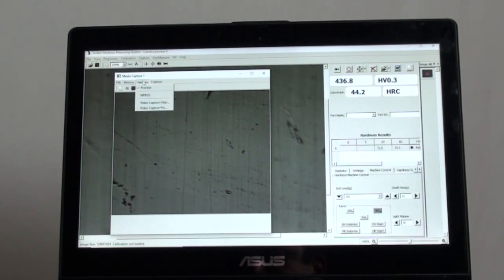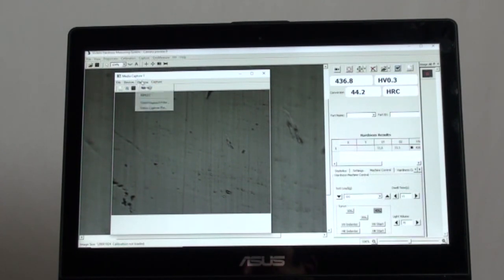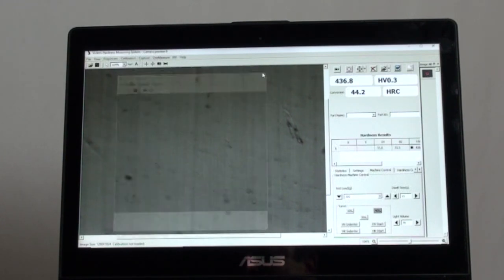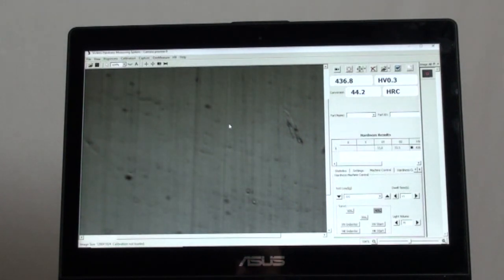Next, move to options and select preview. This will open a preview screen and confirm the camera is working properly. Then close the preview screen.